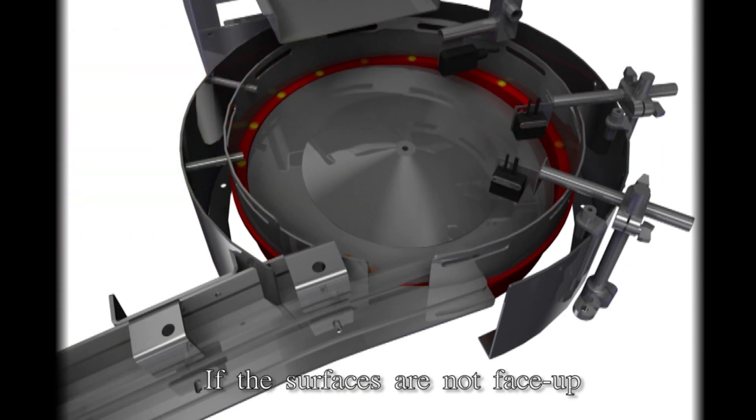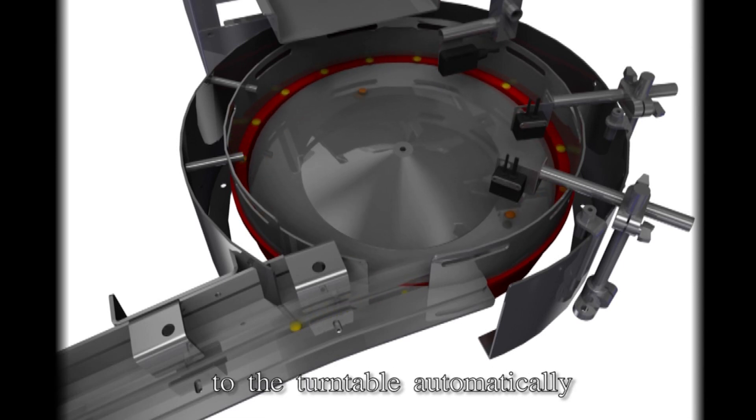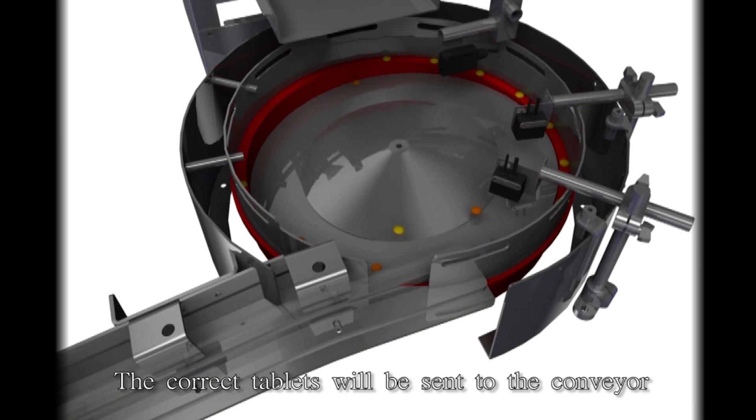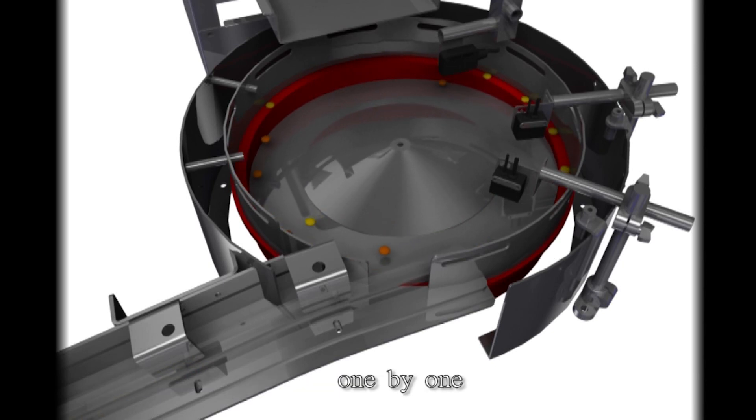If the surfaces are not face up, they will be sent back to the turntable automatically until the perforated surface position is correct. The correct tablets will be sent to the conveyor one by one.